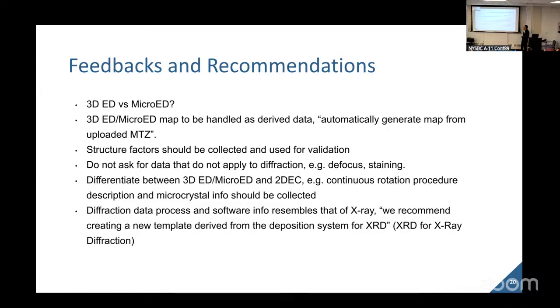And only structure factor files should be used for validation, and we should not ask for things like defocus, astigmatism, etc. You should also have a proper differentiation between 3D MicroED and 2D electron crystallography, because the continuous rotation procedure is specific for 3D MicroED, and this information should be collected for this supplement. And the diffraction data processing software should resemble that of X-ray, because essentially it's a subset of the diffraction method.